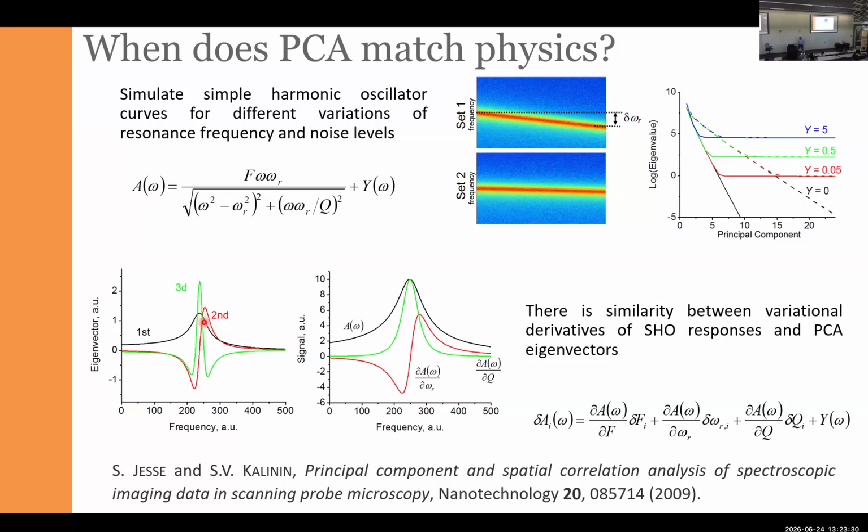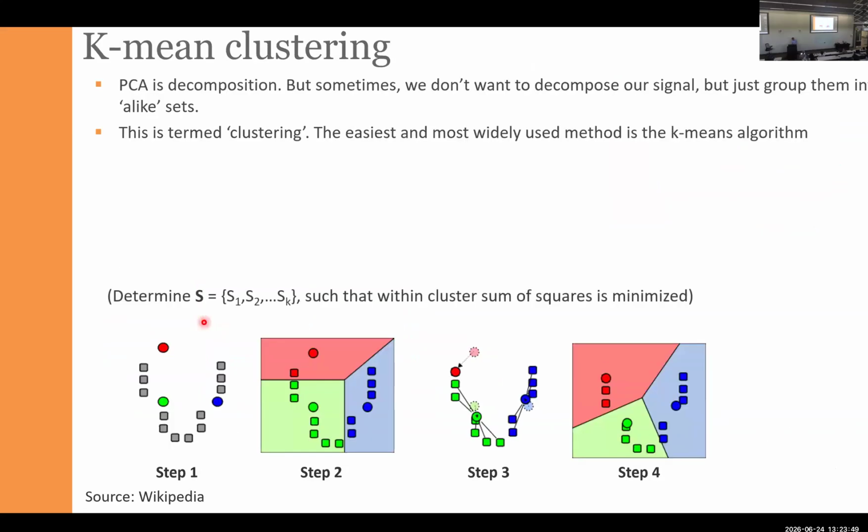the peak. We have the components that go like this. This type of component should be interpreted like a shift of the peak. Sometimes we have components that look like a Mexican hat. This means the change of the width. That's all you can do. If you have the data from two peaks, you can sometimes see whether these shifts are correlated or anti-correlated. But then the things become really complicated really fast.